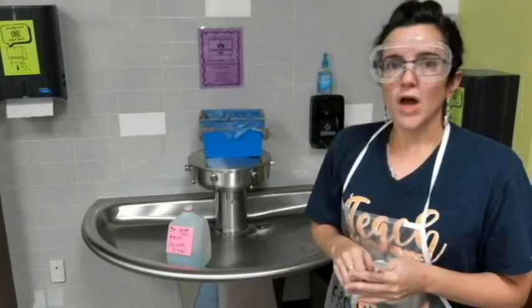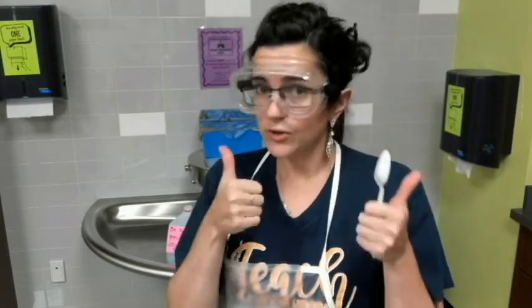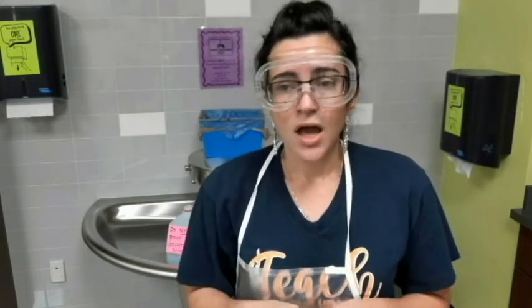So again, we always want to ask and get permission if it's okay to pour down the sink, if it's okay to put straight in the trash can, and so on and so forth. Because again, safety first in the science lab.